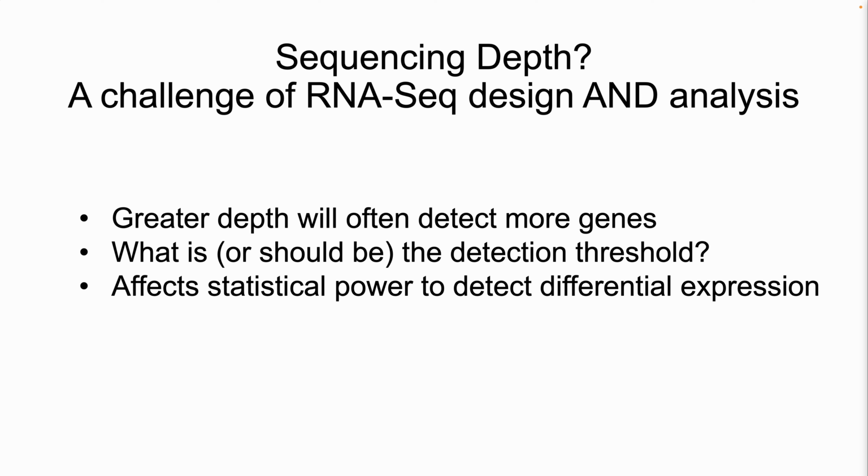Last major, well, I don't know, this is sort of a design and analysis issue of how deep should I sequence? So, just to make sure you're tracking with me, what do I mean by sequencing depth?